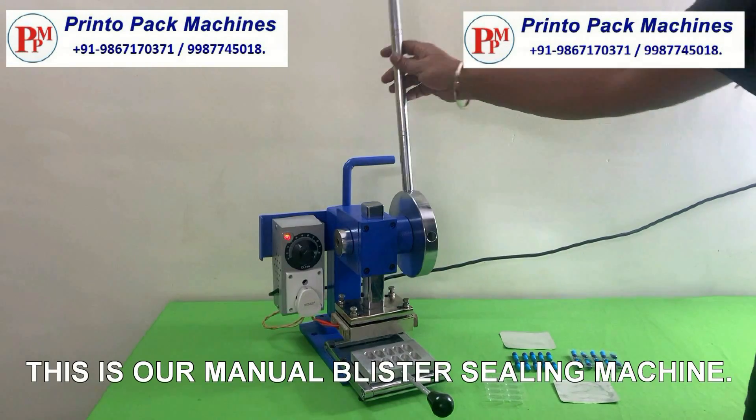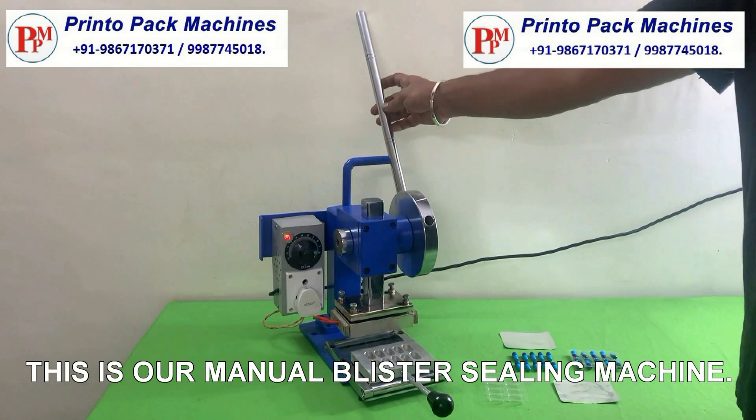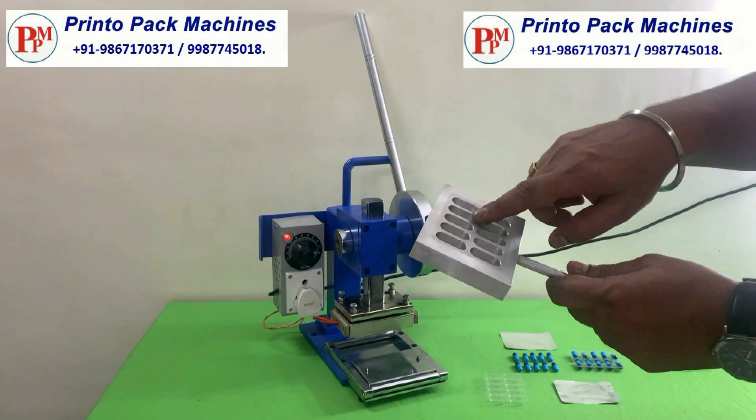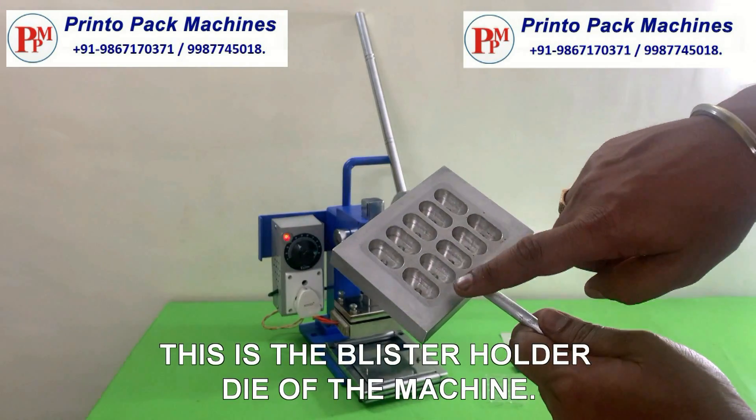This is our manual blister sealing machine. This is the blister holder die of the machine.